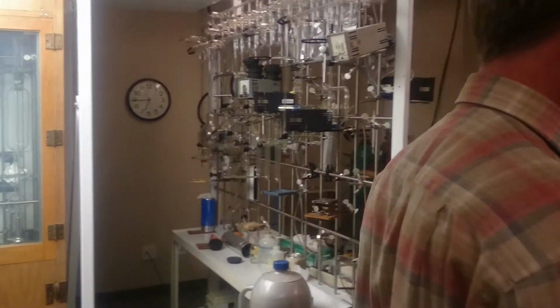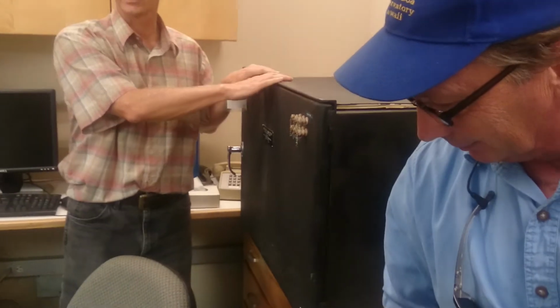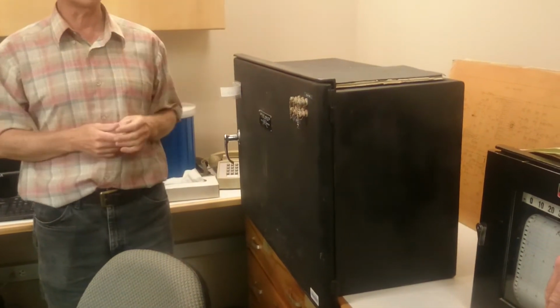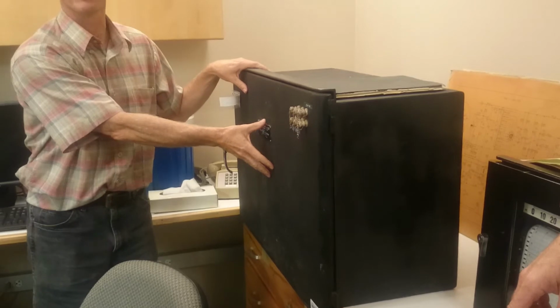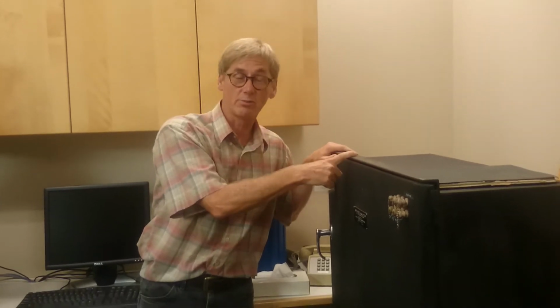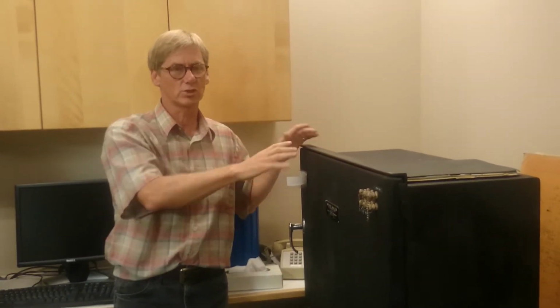This is the analyzer used for making lots of measurements, and one of these was put in Mauna Loa, another one stayed here, and the one here was used to analyze air samples that were brought back to Scripps in glass flasks. And we should have a flask over here too. Samples from Hawaii were brought back here. In Hawaii there was an instrument, and there were also samples collected at Mauna Loa, so that was kind of redundant measurements. But most of the other sites were just flasks. We still bring flasks from all over the world.